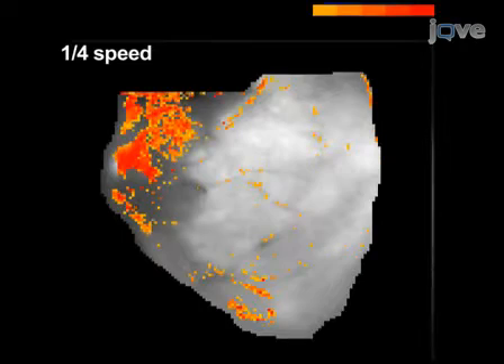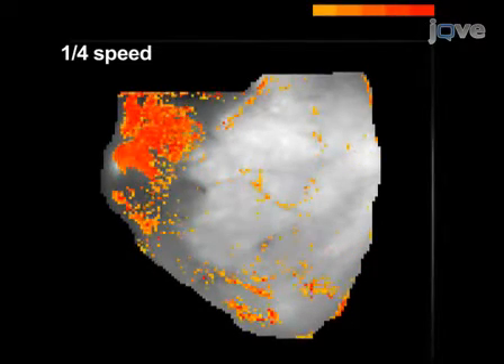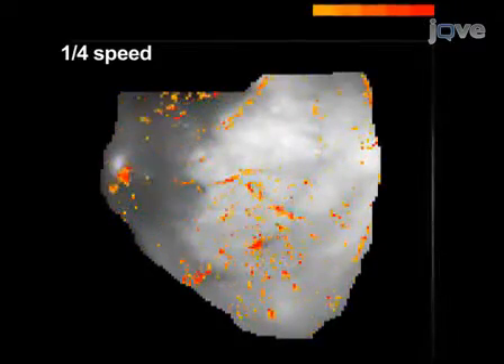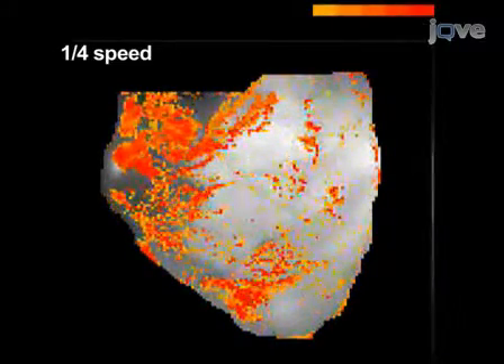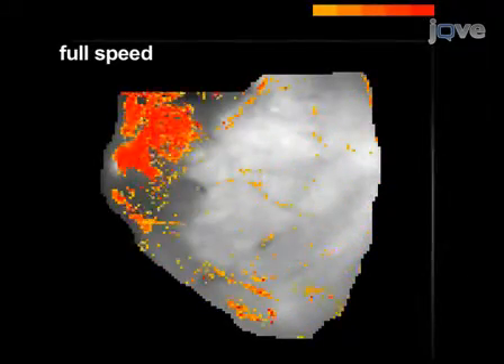If the perfused heart preparation was motionless during recording, the optical signals show one distinct peak for every pixel involved in a change of the emission intensity of Di-8 ANEPS. These real-time imaging movies demonstrate an excitation wavefront propagating across the epicardial surface of the heart as well as the simultaneously acquired electrographic recordings.